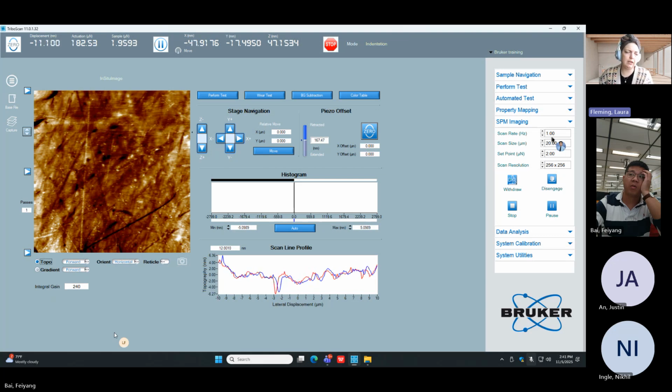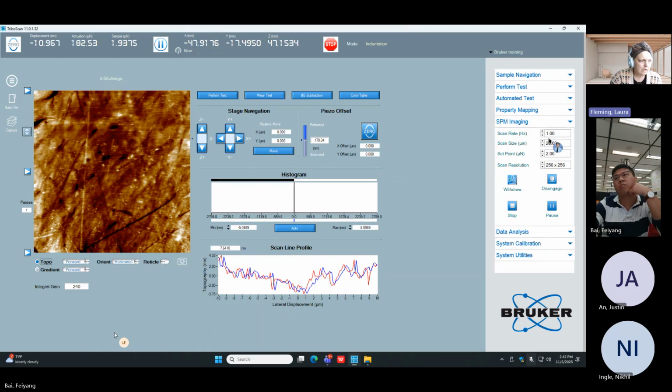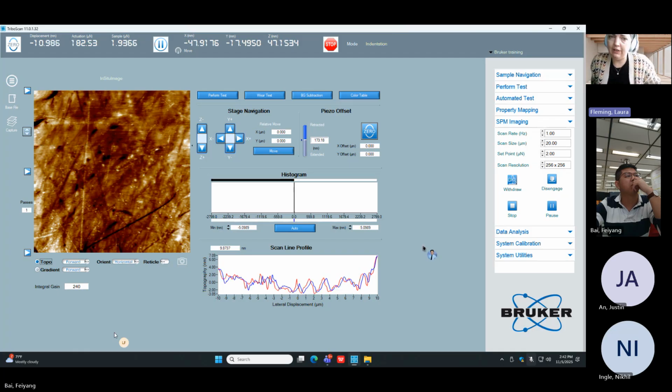The goal is to get the piezo, but for us, the goal is to get a good image that you can make good indents in, either by observing or everything else. No part of my training encourages trying to get those to overlap as well as possible. Okay. It's not important for our system. We are not a closed loop system. We are an open loop piezo scanner, so it's going to have higher hysteresis than an AFM. It's not a one-to-one comparison.